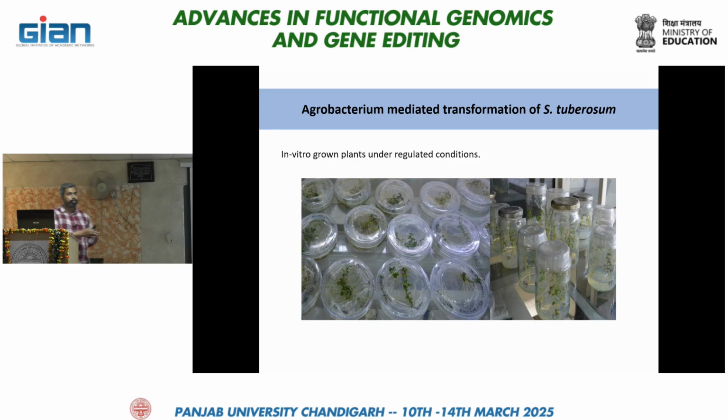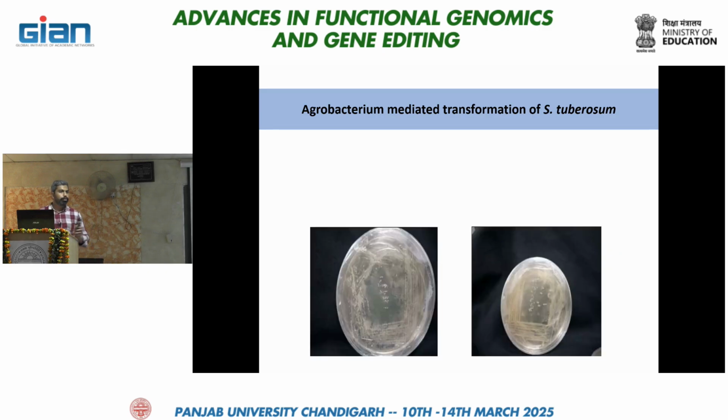So now we can directly take our explant from here. Initially you have to sterilize it because the plant will be growing in a pot or from any other source you are obtaining the plant. Once you have sterilized it and maintained it in tissue culture, you can just directly open it inside a laminar airflow, and simply cut it and use it as it is. You don't have to sterilize it repeated numbers of times, only once you have to do it.